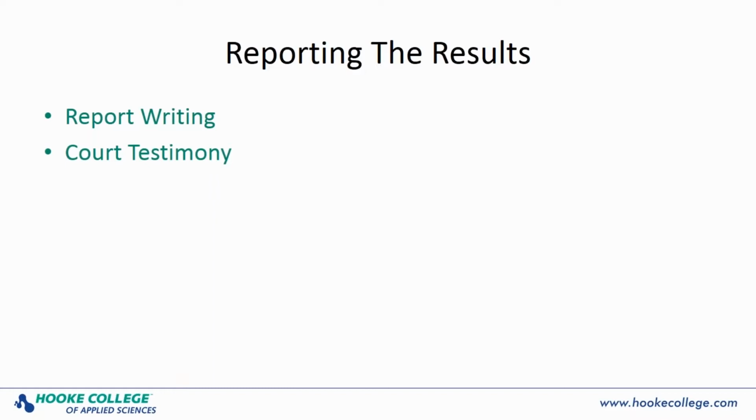Any additional information, such as possible source of the sample or what the implications are as a result of the sample being present, should be avoided or kept to an absolute minimum. These additional aspects of the case should be reserved for a subsequent conversation where there is an opportunity for questions, explanations, caveats, etc. It is also important to avoid any information or comparisons that can be misleading.